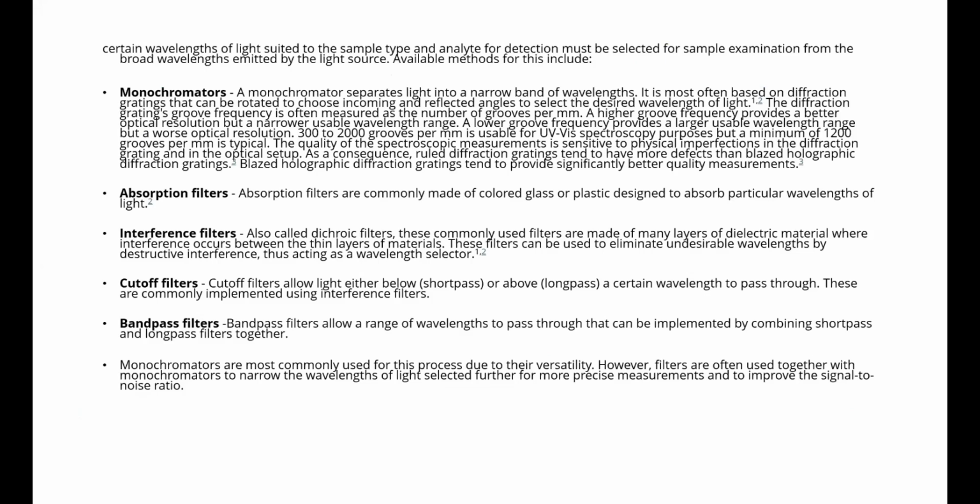Yes, ma'am. So this is about the use of UV visible spectrophotometer for analysis of biomolecules. We know that light is absorbed by a sample analyte. It may be absorbed, reflected, or transmitted. Based on these properties, we can characterize the molecule, its concentration, its purity to a certain degree, and variation with respect to structural composition, that is, if any metal is binding with it, if a ligand and protein form a complex, or an enzyme binds to a substrate, and so on.